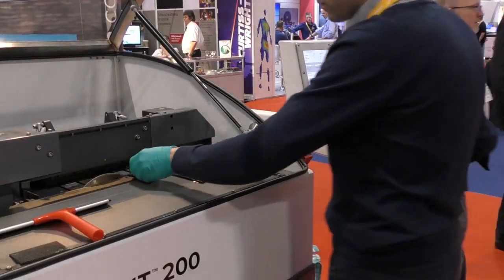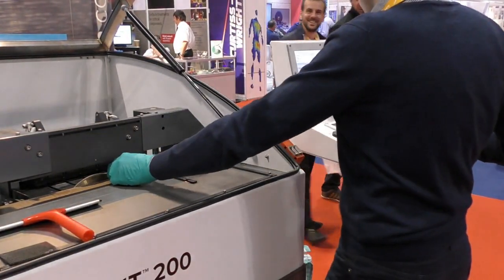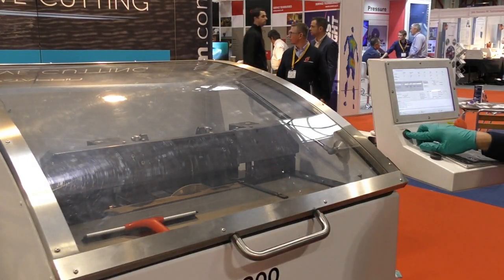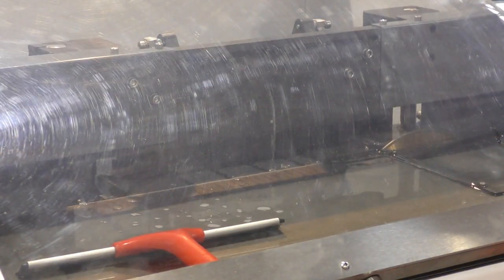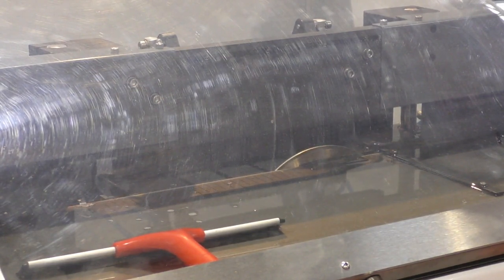Anything that's a composite — if you're looking to cut composite carbons, we can cut that on this machine. If you're looking to cut composite aluminiums, we've just started cutting those — ACMs — and we've also started cutting ceramics on this machine. So it's got a pretty wide spectrum of what it can cover. You can use different blades to get different finishes, but effectively we've got one blade that covers the whole lot. We've been tasking people with bringing their samples so we can cut them here at the show and they can see what sort of finish they get.